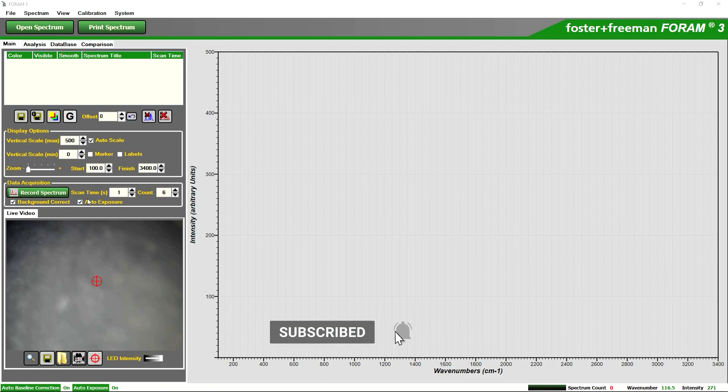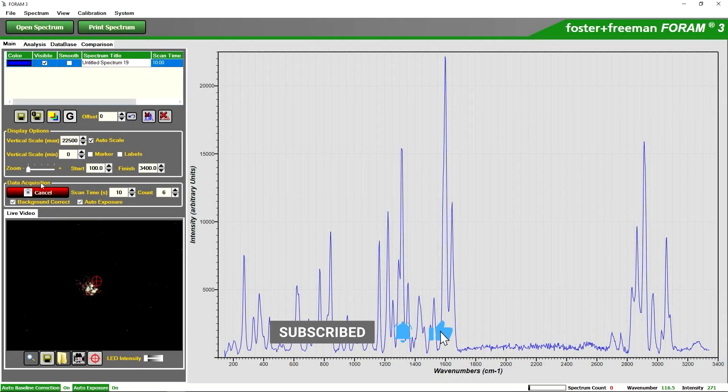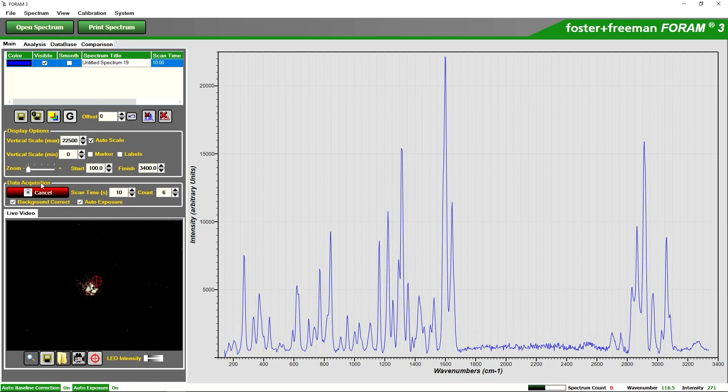Click record. Here the FORAM has chosen a scan time of 10 seconds so we will just wait for in this case a minute as we have six 10-second scans to complete.